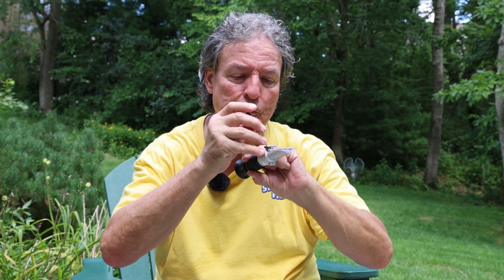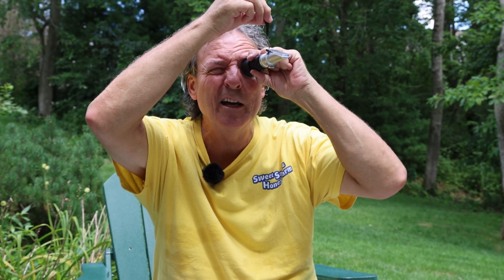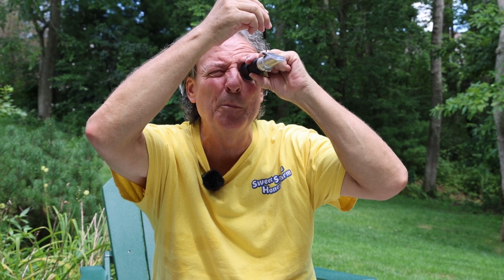So you've got it up to your eye, you're looking at it, and you take the screwdriver and you put it into the screw in the middle of it and just slowly adjust until you're at 71.5. Then you're done. That's it.